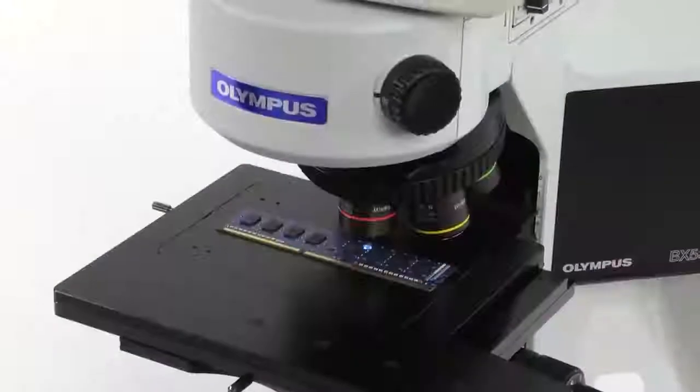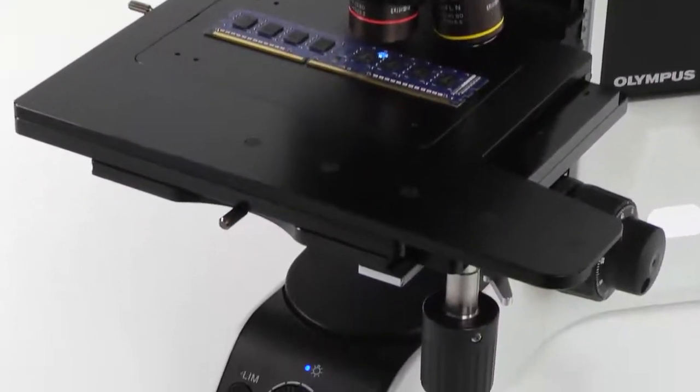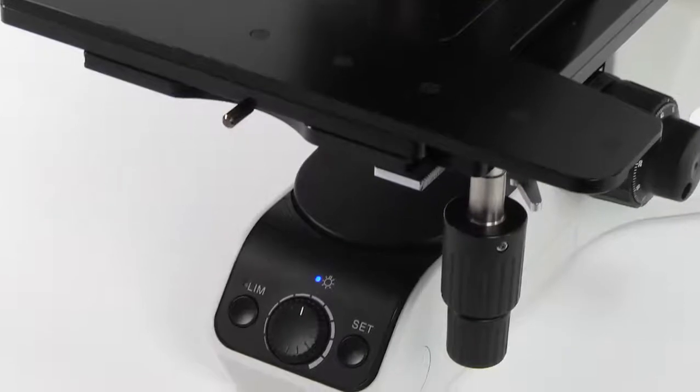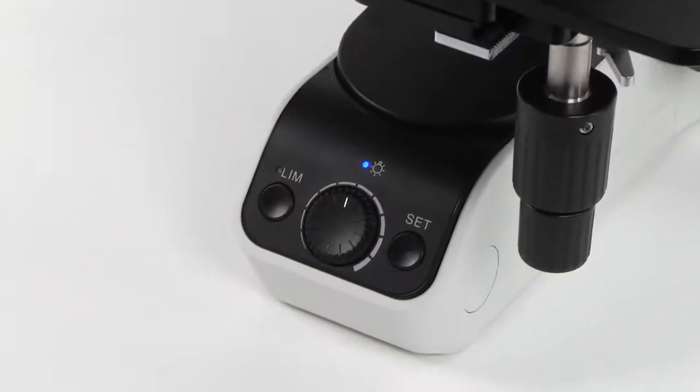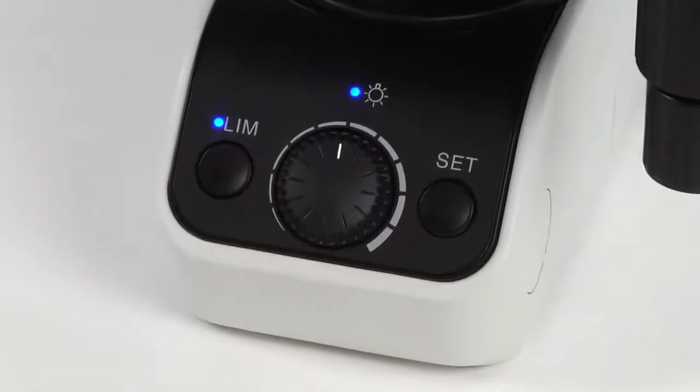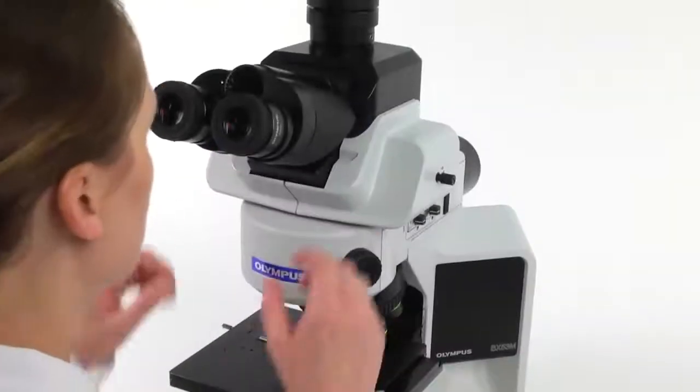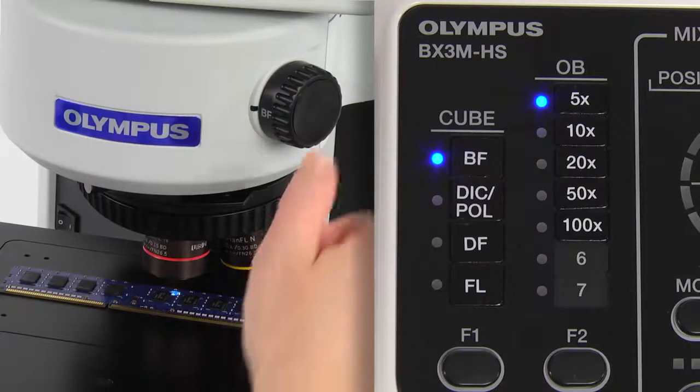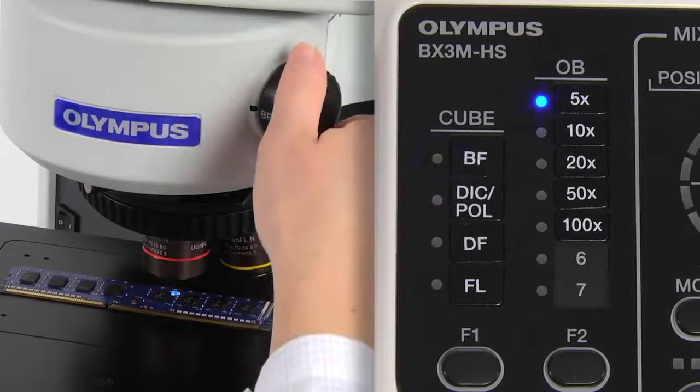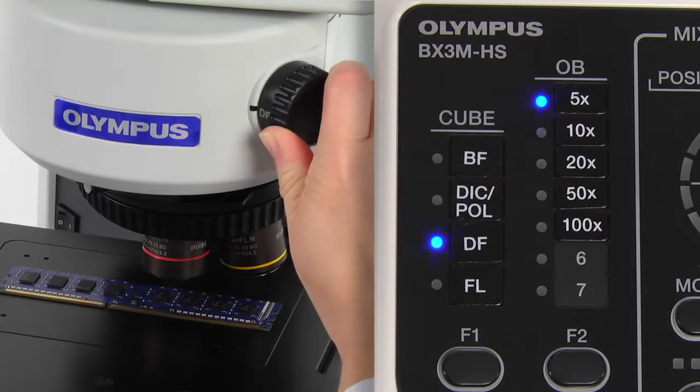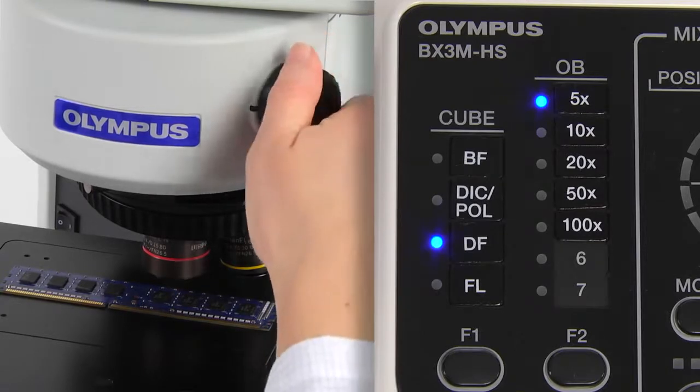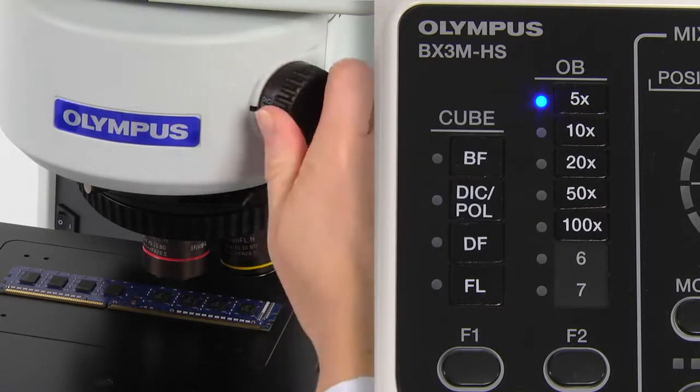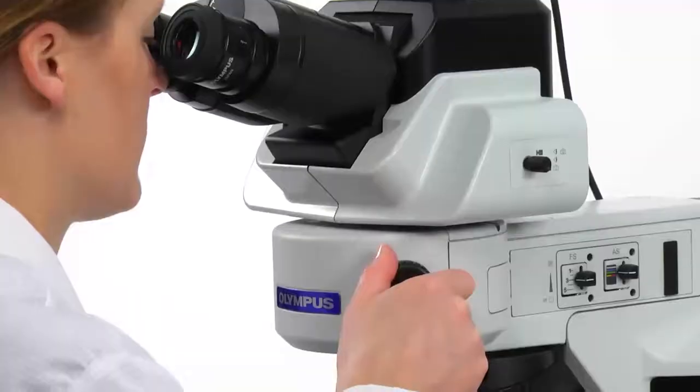For traditional observation methods, setting the illumination intensity with Light Manager saves time and minimizes operator training. Light Manager works with coded hardware by adjusting the illumination intensity to preset values when the magnification and observation method are changed. This takes the guesswork out of optimizing the lighting.